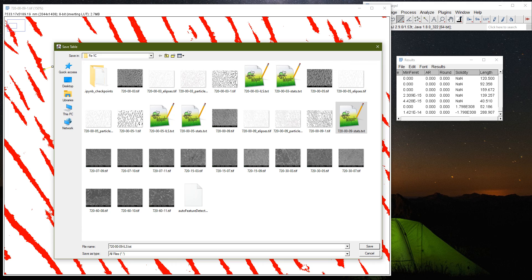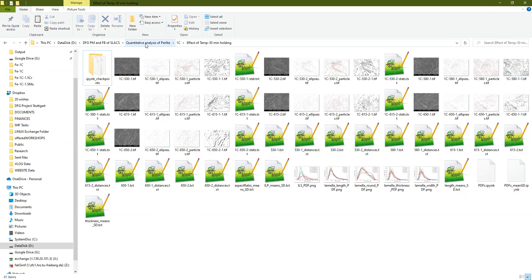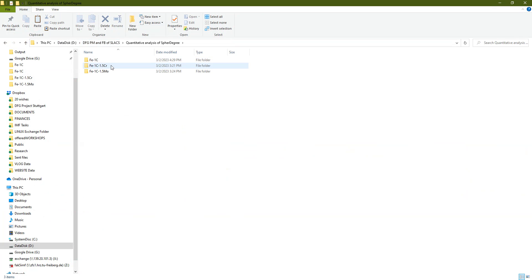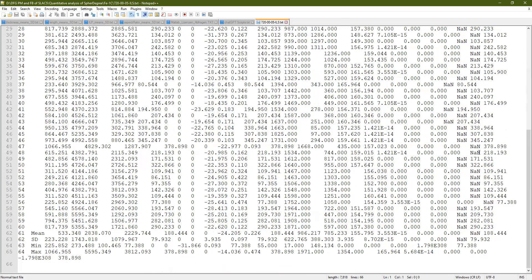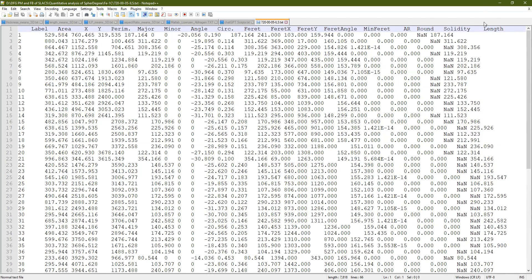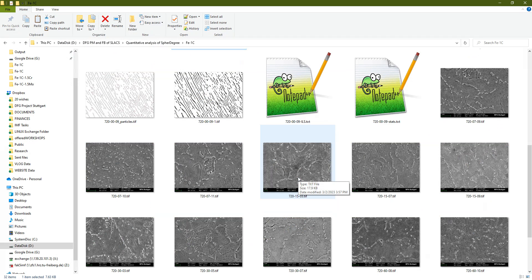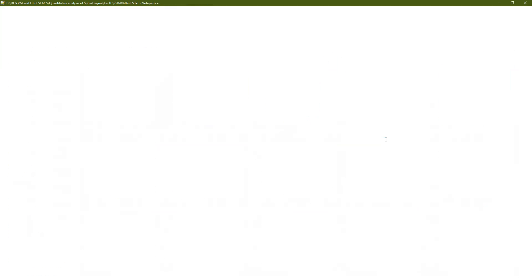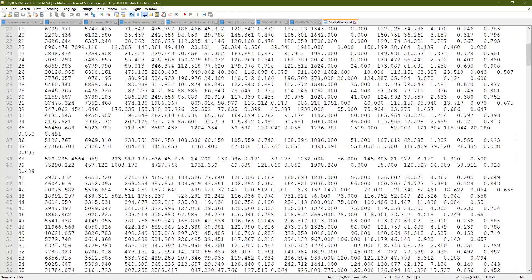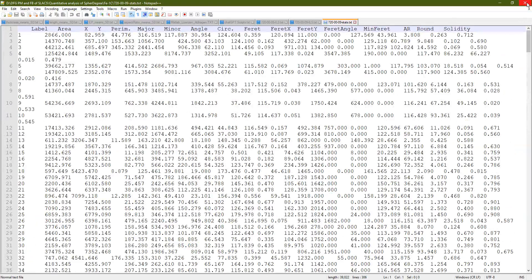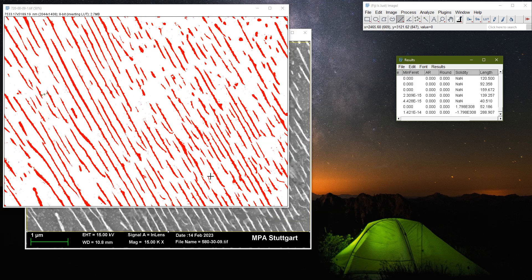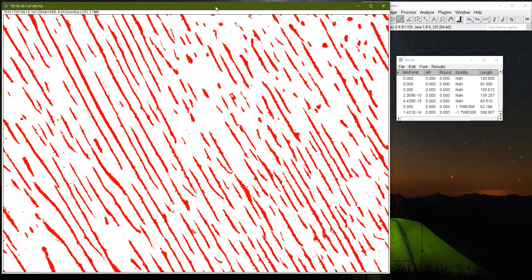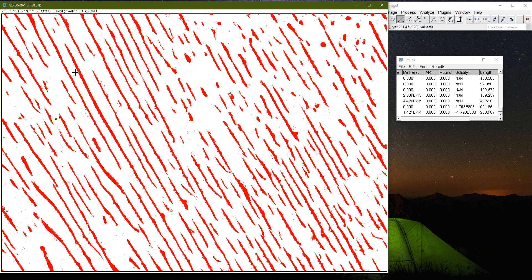Now my data is saved. If I open the ILS file, I can see all the measurement values written there — I am specifically interested in the length values. In the stats file, I can see all the summarized values for every label I measured. This is data that I can then process using any data processing tool or software. So this is how you can measure inter-lamella spacing for pearlitic microstructures using Fiji ImageJ, as well as other lamella features like their length and thickness, quite accurately and quickly.